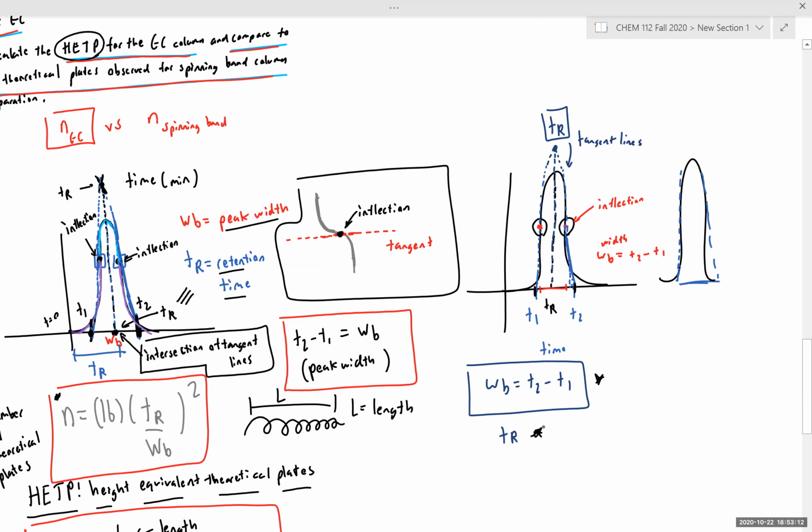Does this look familiar to everyone in terms of how to work up and analyze a peak from our detector output? Does this kind of peak analysis look identical to that which we did in the gas chromatography lab? And don't worry, I'll do a worked example with a printout that we'd observe from the lab from one of my other runs.